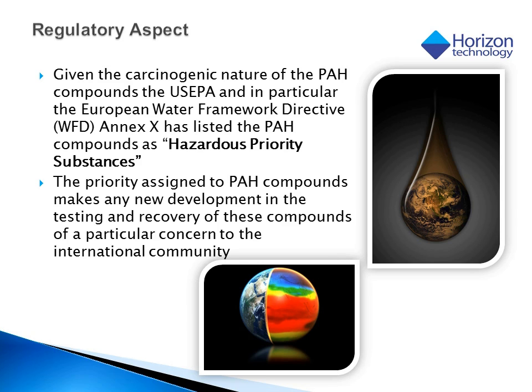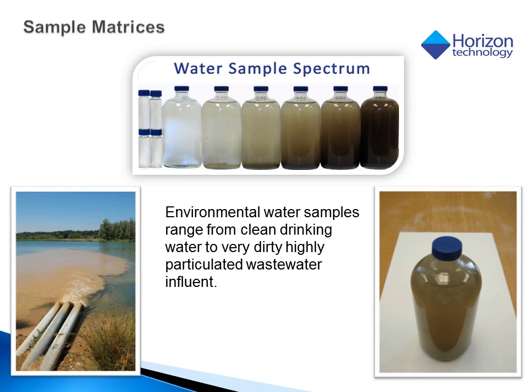Given the carcinogenic nature of these compounds, the U.S. EPA and the European Union, as part of its European Water Framework Directive, has listed these as hazardous priority pollutants. The priority assigned to these compounds makes any new developments in their testing of particular interest to the international community. Today's discussion will focus on the extraction of these compounds from aqueous matrices.